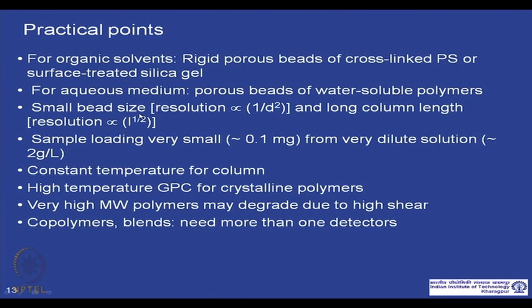The peak resolution is proportional to 1 over d square. So, basically if the bead size grows, the resolution becomes inferior. So, it is always preferable to use a smaller bead size. For example, nowadays 5 micrometer or 10 micrometer at largest is used, which helps in getting better resolution.